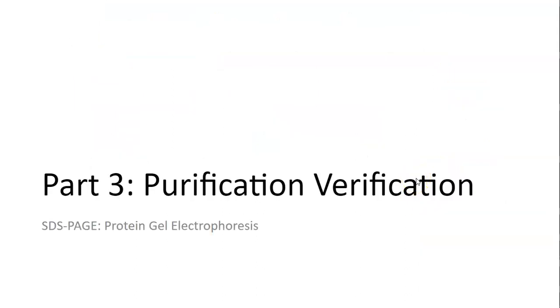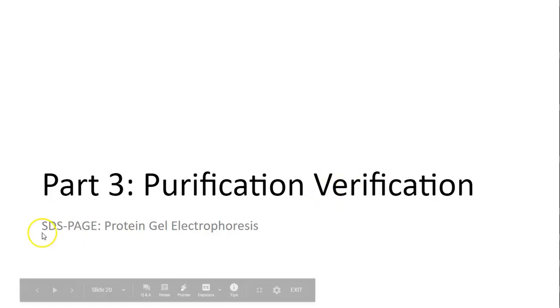But it is possible that you might have captured some tag-along proteins of similar size. So if that happens, then you need to do the final step, which is verification that you did indeed get what you wanted. And that'll be in the next short video.